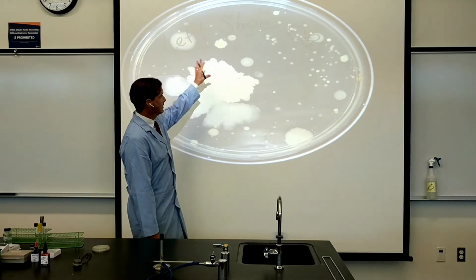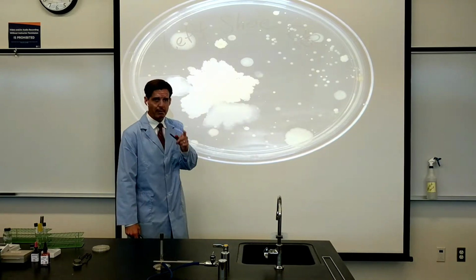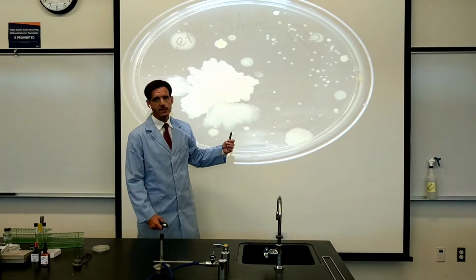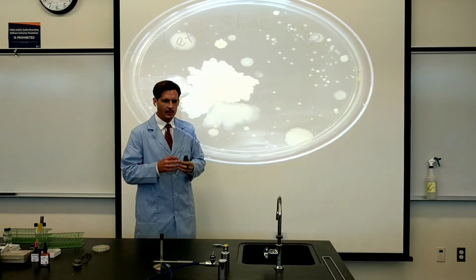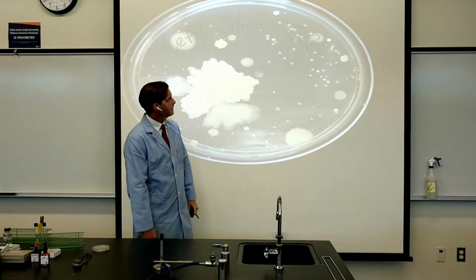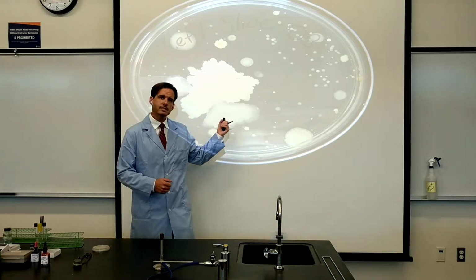Now, most bacteria you can see are white, and most are also opaque. They have a milky color to them, but occasionally you'll see bacteria that are clear, translucent.